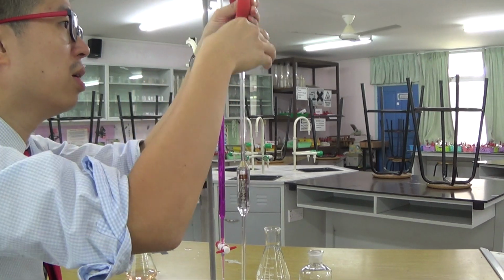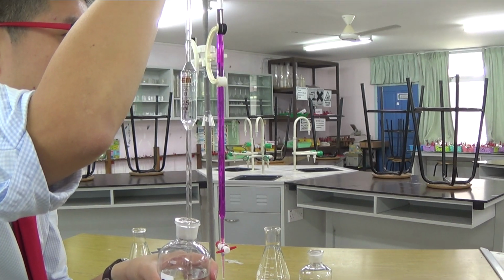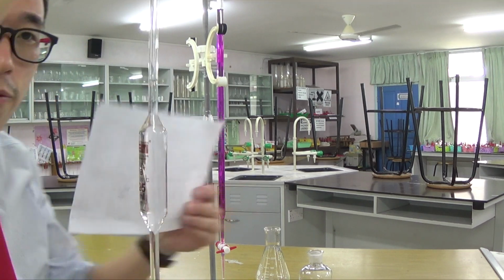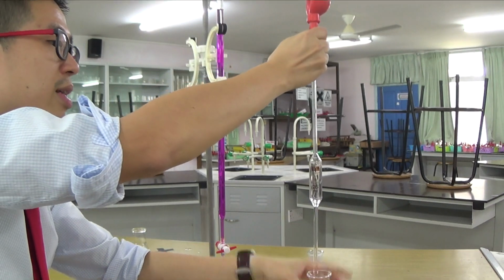So be careful. You only read above the meniscus when it's a dark color solution, but you read below the meniscus if it is a colorless solution. So this is 25 cm cube. You can see that below the meniscus, okay? Now this is my conical flask which I rinsed with distilled water earlier.